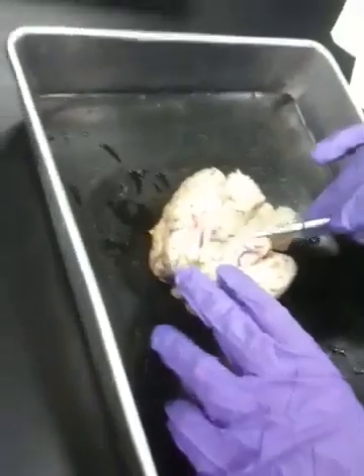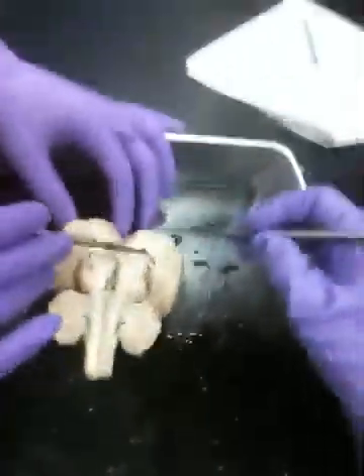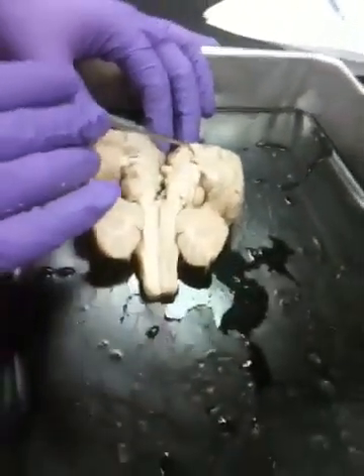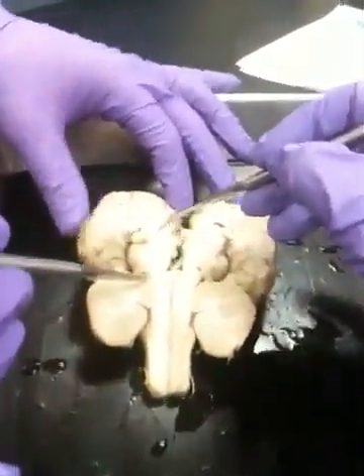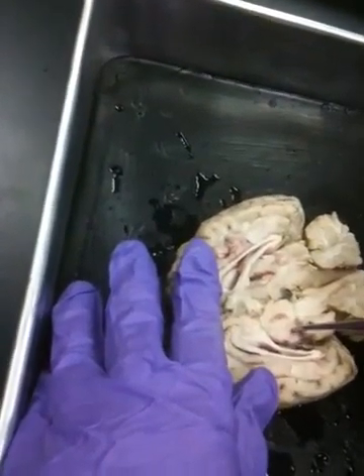Corpus callosum, along the top of the lateral ventricles, this white bundle is corpus callosum. So you can probably feel with your tool, it feels different than the surrounding. This is nice and soft, and this is really hard because it's tracts running across. Thalamus, they want you to be able to find the thalamus. That's what this third ventricle is around. So this sort of egg in the middle, that's the thalamus. There's one half, and there's the other, and here's thalamus, and here's thalamus here.